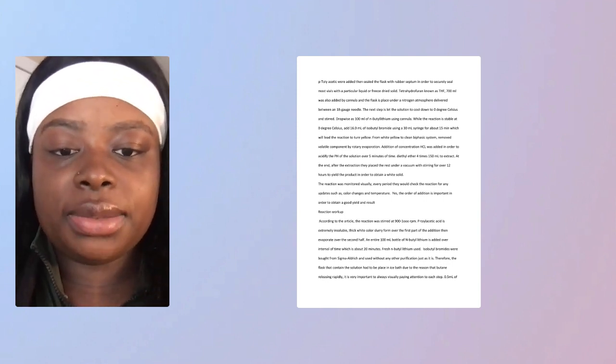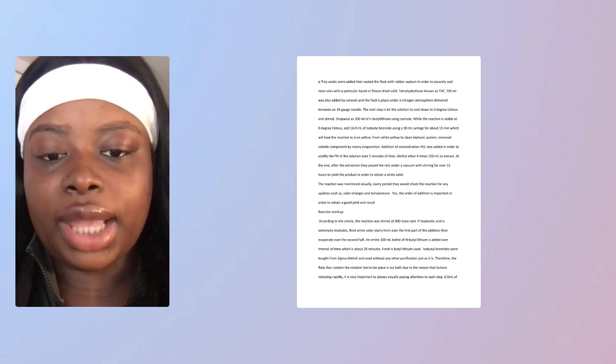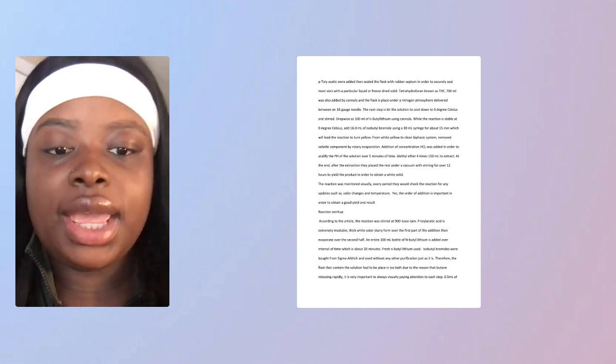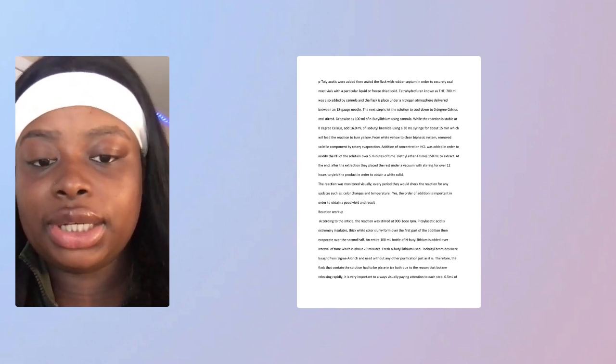The reaction was monitored visually. Every period they would check the reaction for any update, such as color change or temperature. Yes, the order of addition is important in order to obtain a good yield and result.